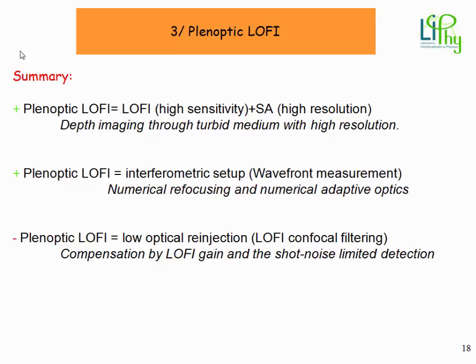Secondly, another advantage is that the Plenoptic microscope using the LOFI setup is an interferometric setup, which allows us to register the amplitude and the wavefront of the feedback electric field. And knowing the wavefront, we are able to focus on any surface, and to numerically correct optical aberration. So our Plenoptic microscope is well adapted for imaging through heterogeneous medium.